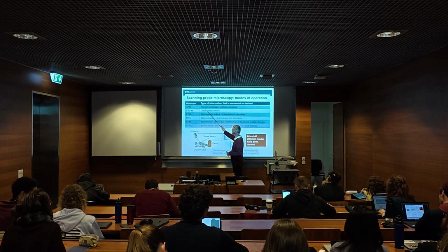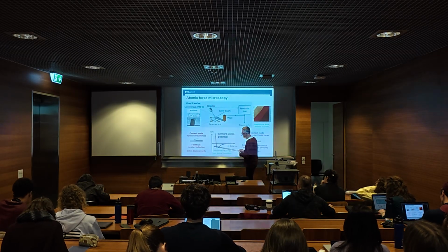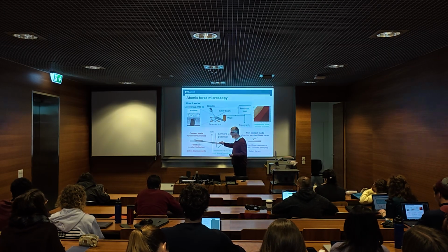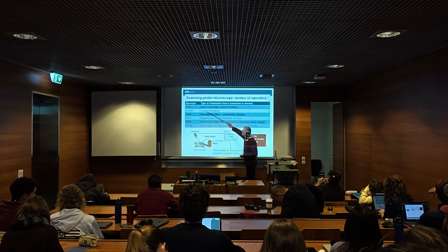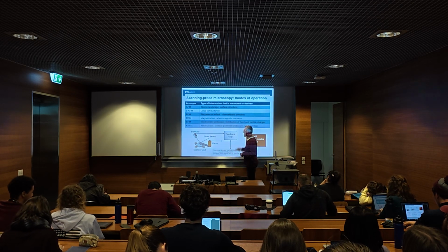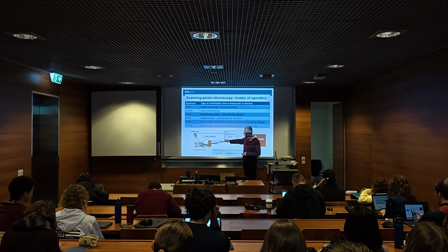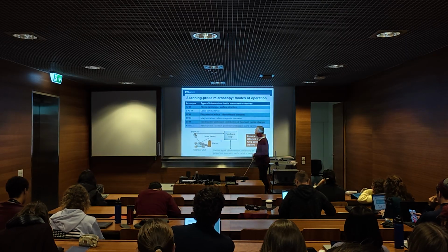I just described the principle of atomic force microscopy, but you could also say your tip doesn't measure the deflection of the lever, but what you instead measure is the electrical current going through the tip. Then spot by spot it would measure the conductance of your samples. Then you have something called conductance atomic force microscopy. You can also magnetize your tip, and then the attraction by the surface is not any van der Waals force, but the magnetic field of the surface that you measure. And you have magnetic force microscopy, and so forth.